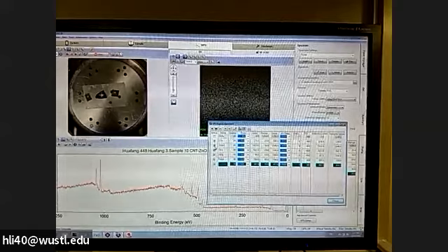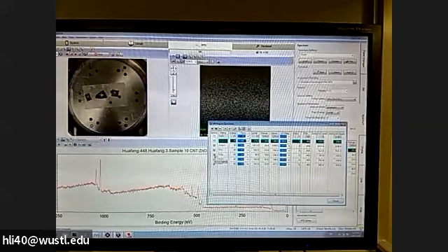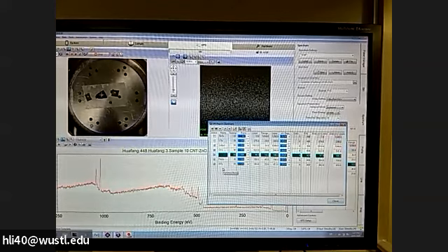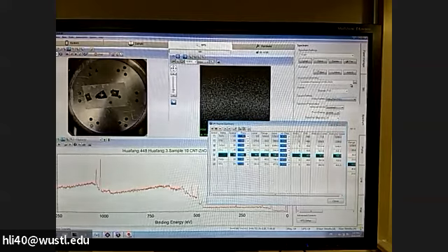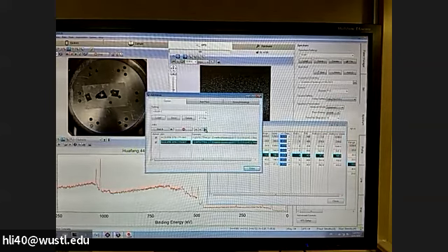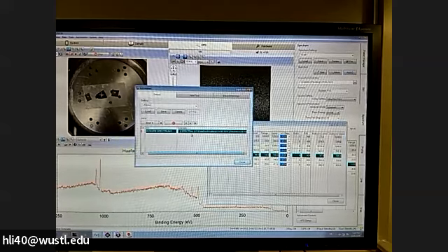The switch, we put it right. We are interested in zinc, oxygen, silicon, iron, and nitrogen for this first sample. We just need to add to the queue. If you add to the queue, you see a long list there; just delete all and click add to queue again. So this will be sample one, where we are interested in these elements.